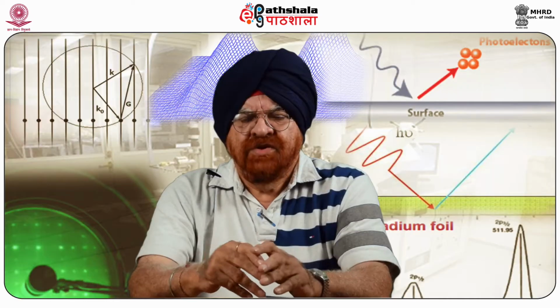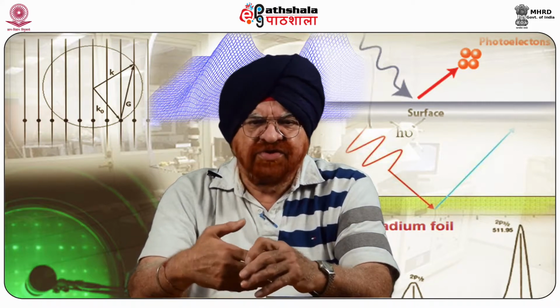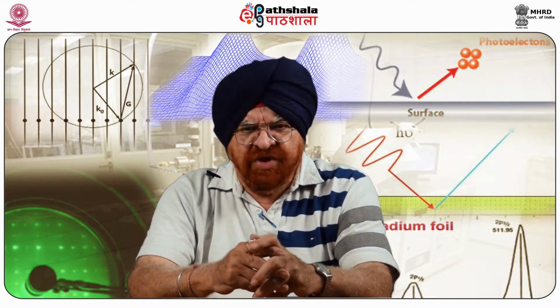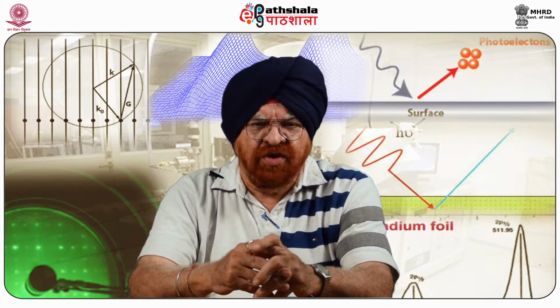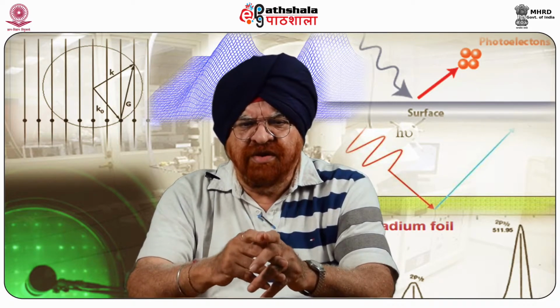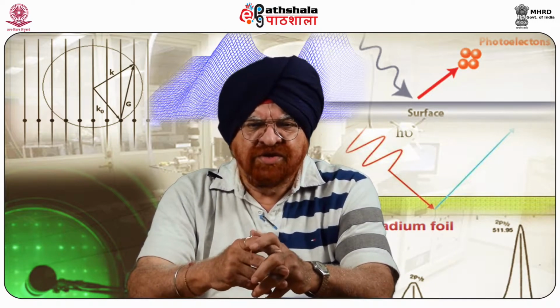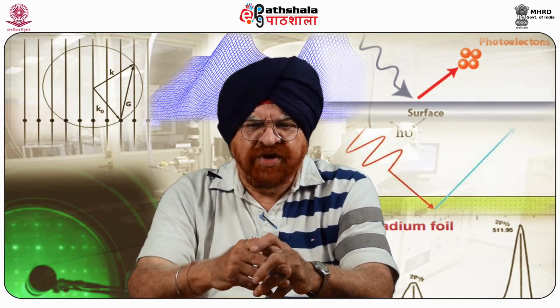So students, after having learned about the basics of this spectroscopy called ESCA, we can now summarize, because we are in a position to do that. And when we summarize this particular module, we learn the following: that Kai Siegbahn, a Swedish scientist, and his research group in Uppsala, Sweden, recorded the first high energy resolution ESCA spectrum of sodium chloride, and this was done way back in 1954.